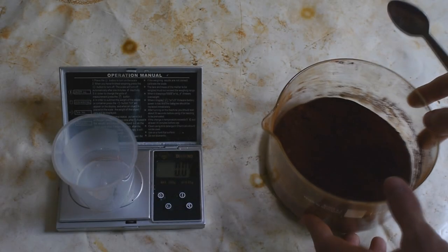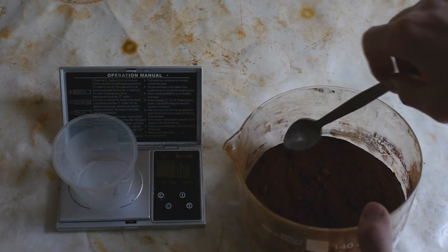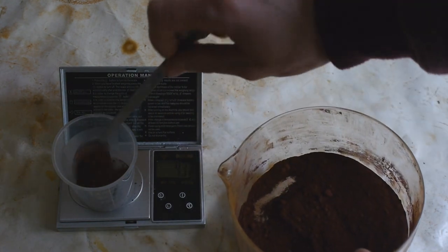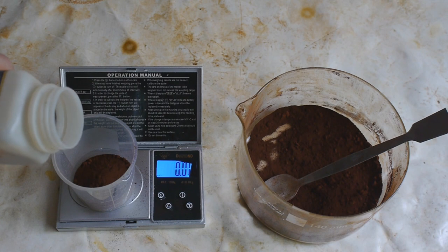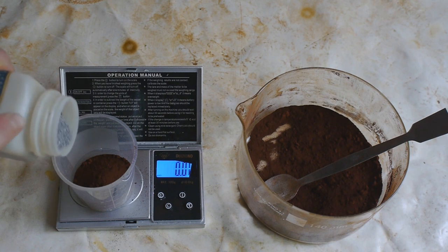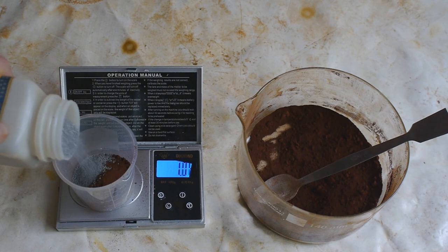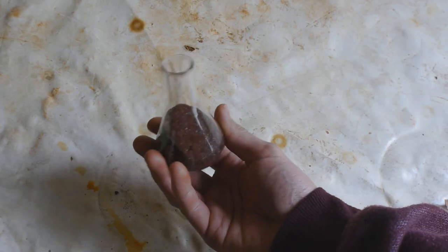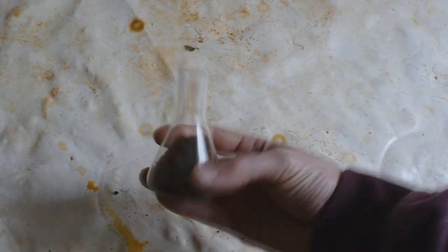Now for the fun part, let's try to make some thermite. So we first measure out some of our freshly made iron oxide. And then we add a stoichiometric quantity of aluminium powder or granules. This needs to be mixed up thoroughly. There we go, that should be good.